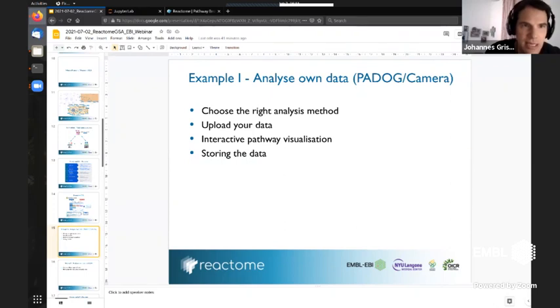Can we do this analysis with any annotations such as gene symbol? Yes, we support, I think, 20 different annotation types. Just put it in, we most likely support it. If not, send us an email, and we'll probably be able to fix it.